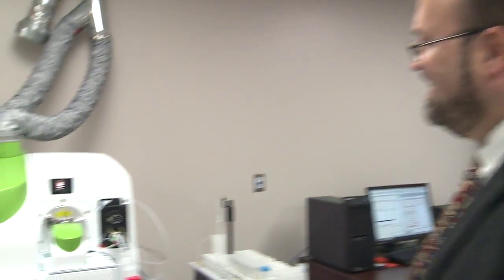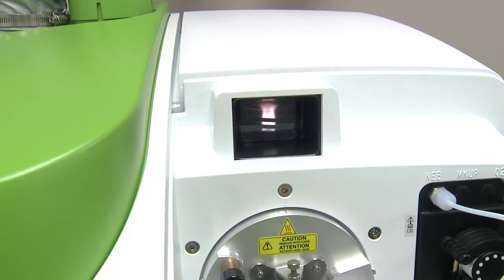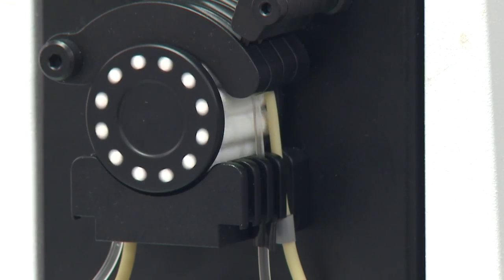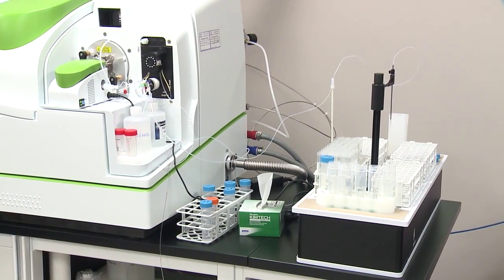That's pretty cool. Oh, I think we should get a close-up. Yeah, you can take a look. Don't get too close, because it's burning at the heat of the sun. Don't touch anything, or we'll have to invalidate our results. All right, there we go. Wow, neat. So it pulls the samples out of there, and then it spits out the results, and that's what the analysts put in the reports.